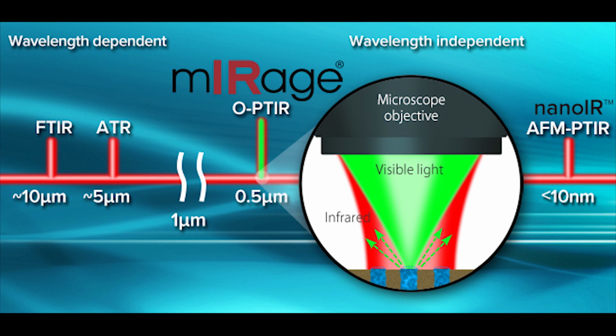There was a question, Kurt, for multi-layer film measurement, is cross-sectioning required? No, it isn't. We demonstrated that we can get off a stub sample that a section was cut from. You can also look at the cross section, but it's not necessary to cut a thin cross section to be able to make a measurement. Yeah. So Kurt showed examples of measurements first on a cross section, and then we followed that up with measurements on what he called a block face sample, which is just where you've cut or polished the top surface, but it's still a bulk film.